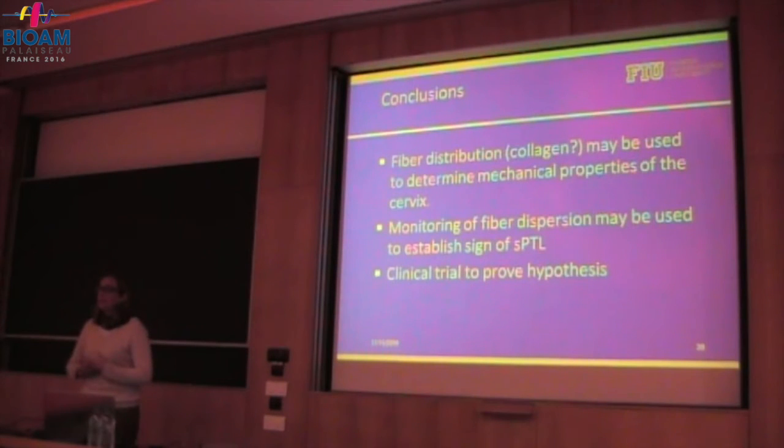Yeah, so we were interested in different things. We knew the effect was fairly superficial, so we didn't think we had to go really deep into the tissue, and it has been shown by the people doing MRI and other people that this circular arrangement, let's think about it as plates, is kind of parallel to itself.